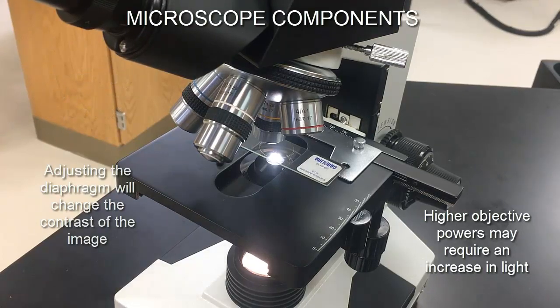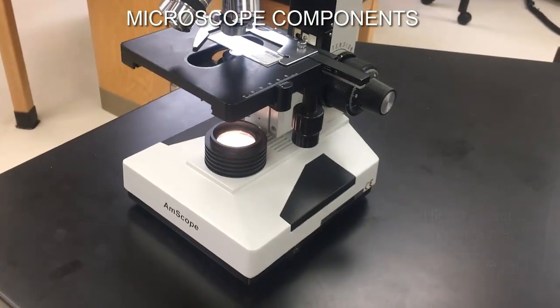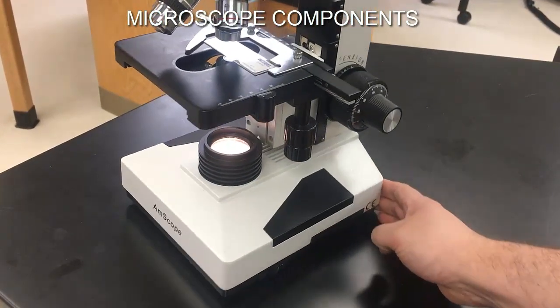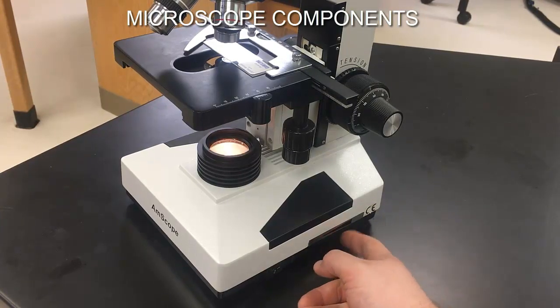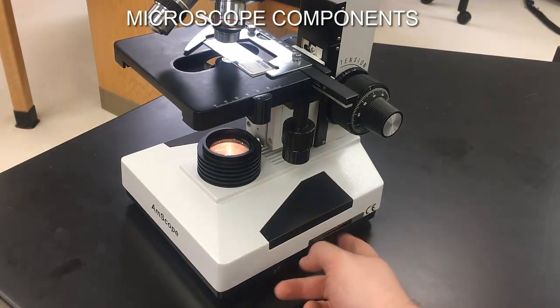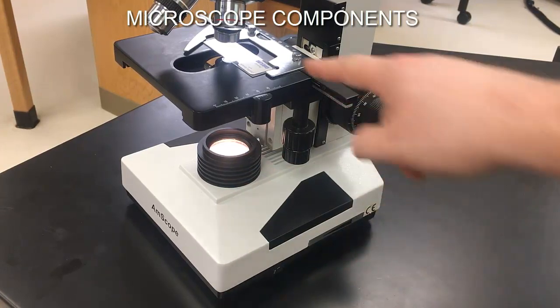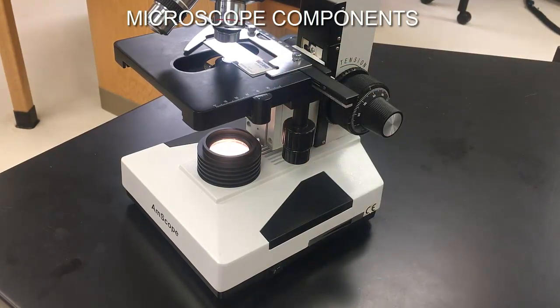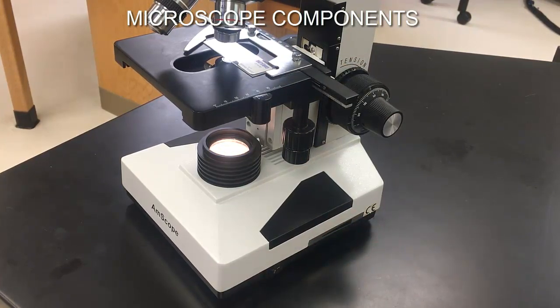Some of our microscopes — the Amscope models — have an extra light dimmer switch on the side. You can turn the light down or up with this dimmer switch at the source. That's one way to control the light, but the best way is at the condenser with the iris diaphragm. Some microscopes don't have that extra dimmer switch because controlling the light right at the condenser is really the best approach.